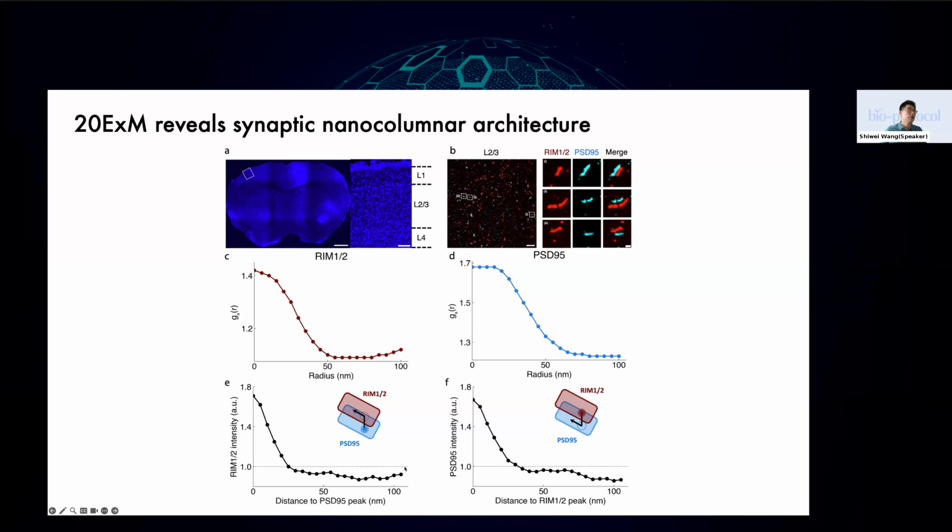And furthermore, we performed cross-correlation analysis, which looks at how closely these clusters align with each other, and observed that both of these clusters align within 25 nanometers of each other.